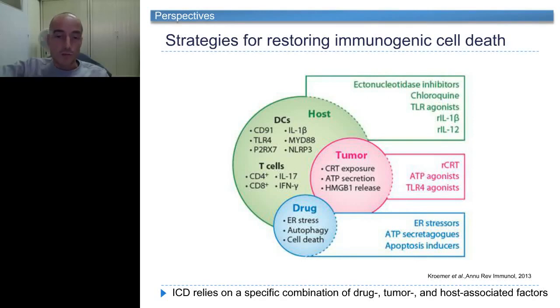So we were very happy that we had access to these patient files, because the retrospective clinical study proved that the in vitro image-based approach that we initially have chosen detected a drug that has the capacity to cause immunogenic cell death in vitro, in vivo, and also in patients.